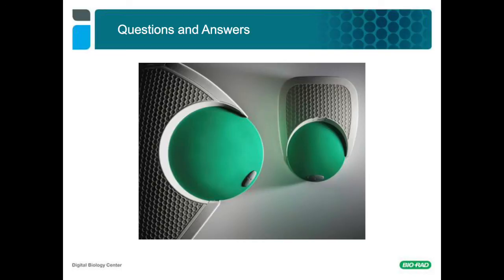So we have a question regarding Droplet Digital PCR technology. How would this technology work as a replacement for FISH and CGH assays commonly used in genetic testing? And are there any cases in which you would not use ddPCR?